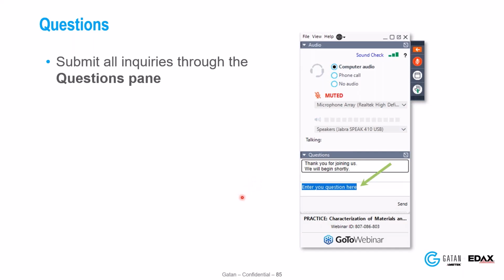You select it as an image processing routine, and when you select it, you can select NPar or what level of NLPar you want to select. The more levels you do, basically it's a higher computational time, but more averaging between them.